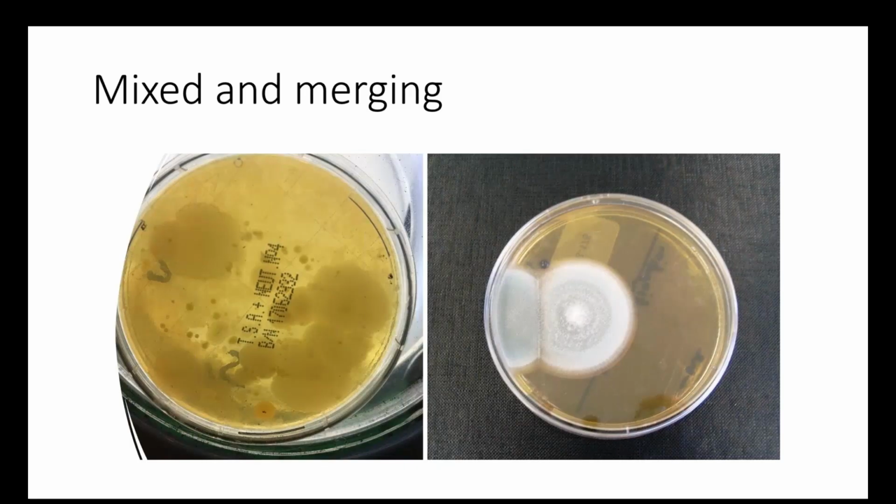On the slide now, we have a photograph of problems with colonies that are either merging or clumping together. So the plate on the left-hand side is a bioburden sample, a sample that's been plated, and there's a bacillus-like organism. You've got a lot of clumping, the sample's not been adequately mixed. And then on the right-hand side, we've got two colonies merged together, or maybe it's more than two colonies merged together. It'd be something that would need to be looked at a little bit more closely.